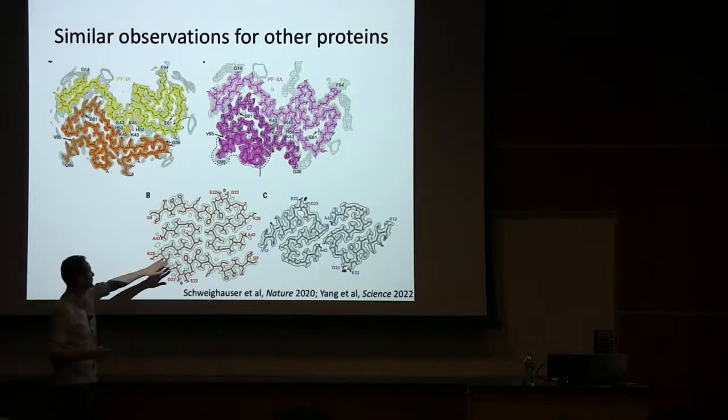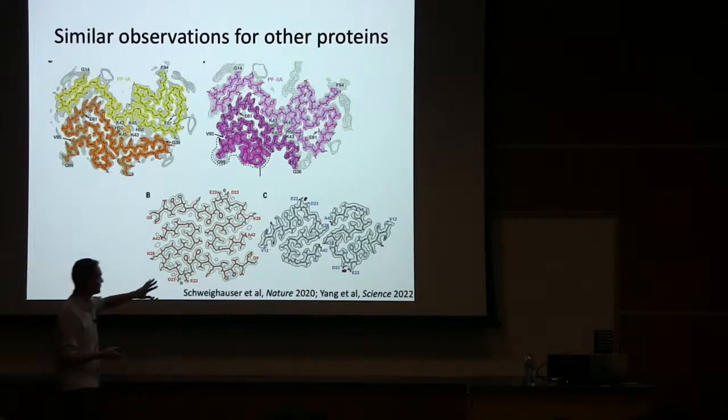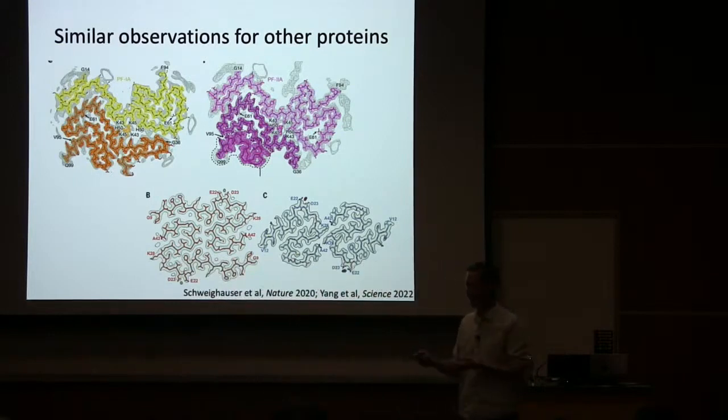And then down here, very recently this January, Yang in the lab was able to isolate, with new extraction procedures, bona fide A-beta 42 peptide filaments from a range of different diseased brains. If you have sporadic Alzheimer's disease, you tend to not always have these. And if you have familial forms of Alzheimer's disease or other diseases, you can have A-beta accumulation together with alpha-synucleinopathy or so. But then the filaments tend to look like this. And why this all is, we don't understand at all. So we're just gathering data and images and trying to understand this.